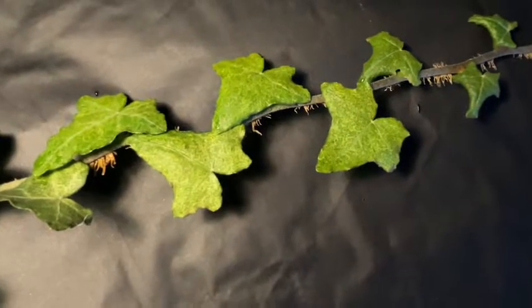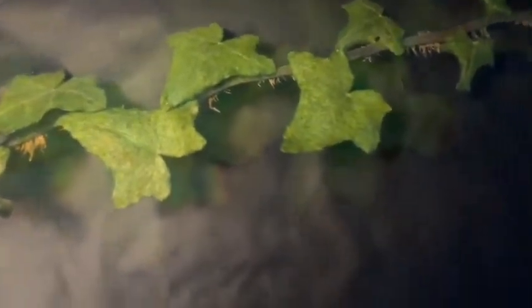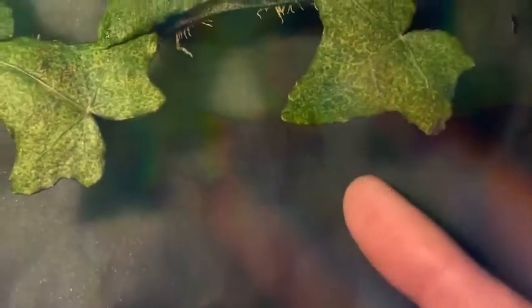Also, just a side note, if you put the green leaves on black paper and then use the diffraction grating to view them, you can see how much green light is being reflected off of their surface. You see a little bit of red, a little bit of yellow, a little bit of blue, but you see those bright green colors just radiating off the surface of the leaf. If I put my finger up here, my finger's more red, and so you see the red and the yellow outline of my finger in this spectrum that's being reflected. But if you put the leaf up, you see more of the green part of the spectrum.